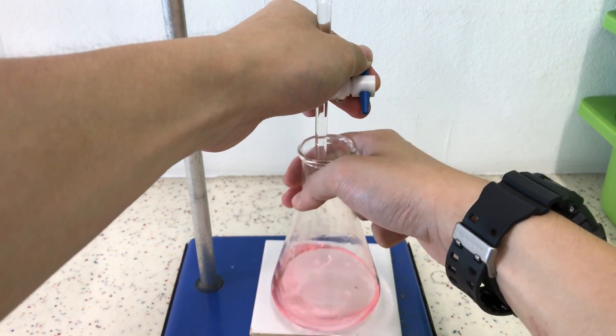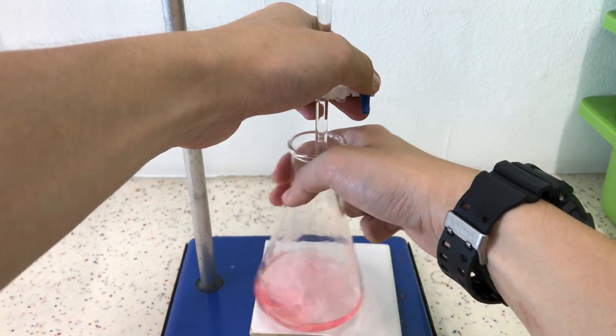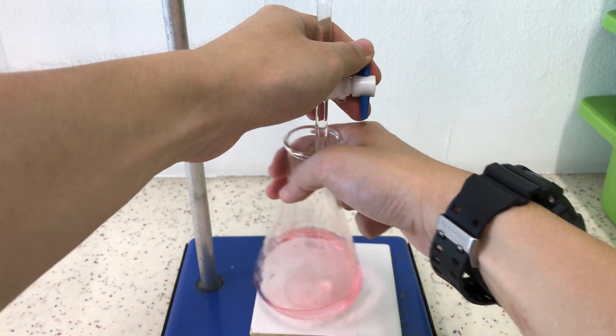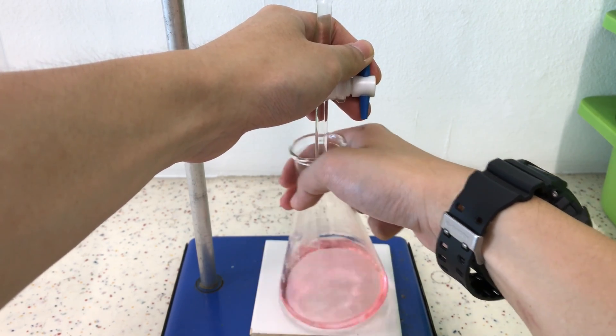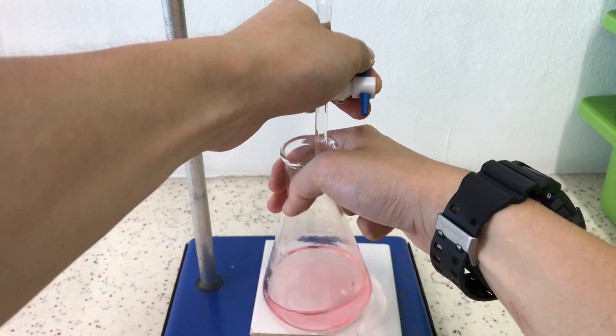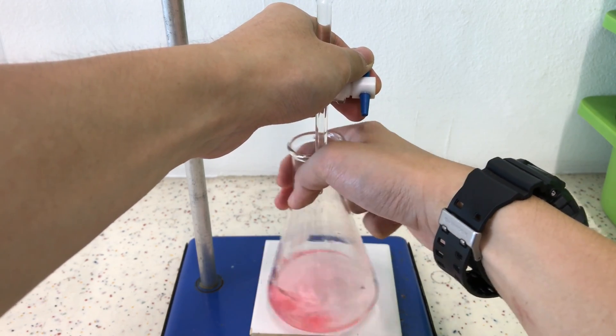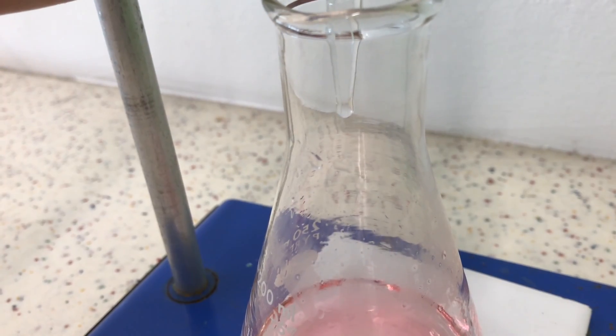Nearing the end point, we will slow down the addition of the titrant and do dropwise addition with swirling after each drop. Now let's fast forward a little and see how dropwise addition is being carried out.